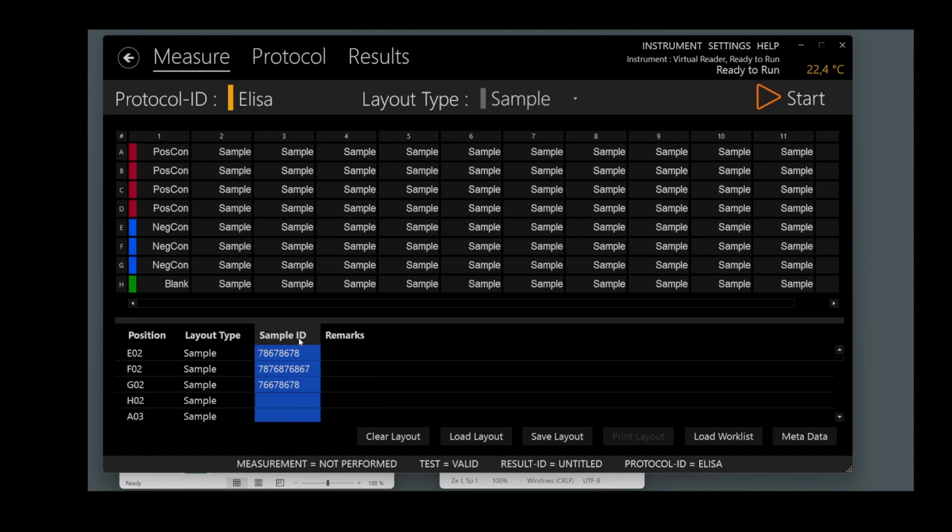If several positions are selected in the rack, the text entered is assigned to all selected positions. If the text input ends with a number, the software increases this number by 1 before it is assigned to the next position. This makes it easy to implement consecutive numbering.